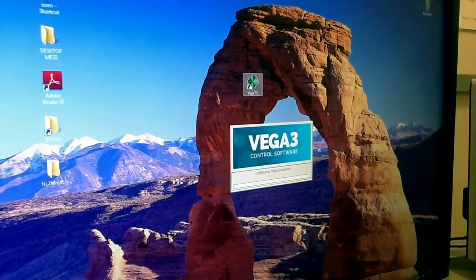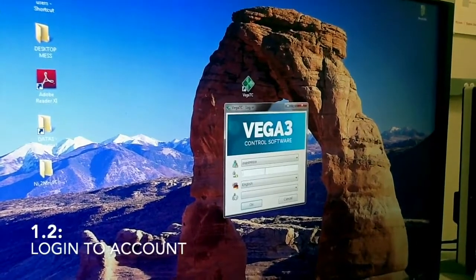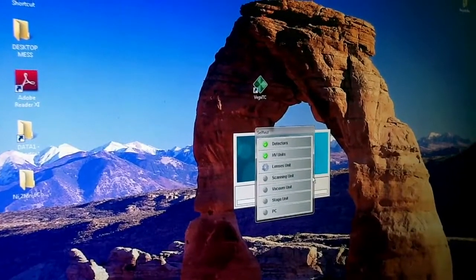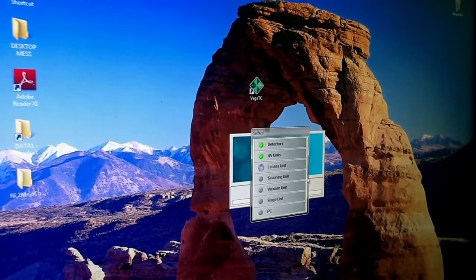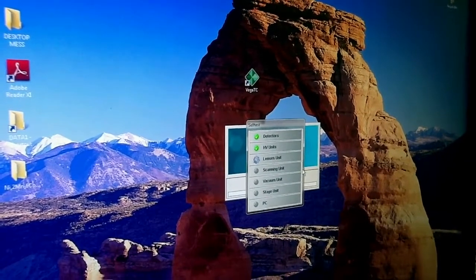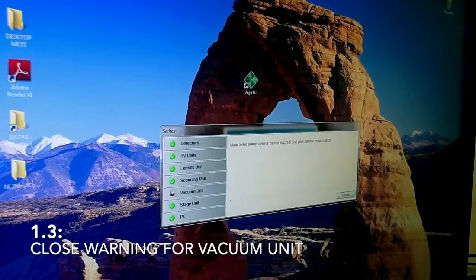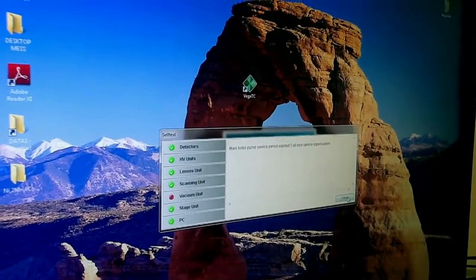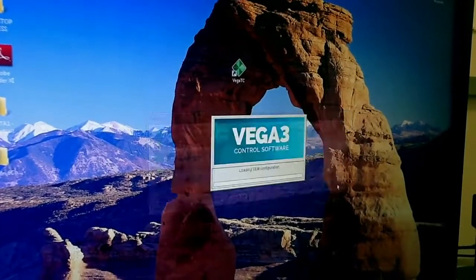You will have to log in to your account. I will use the Supervisor account. All the different components of the software are being initialized. If you see this warning in the vacuum unit, I just neglected it — it's because the maintenance time passed.